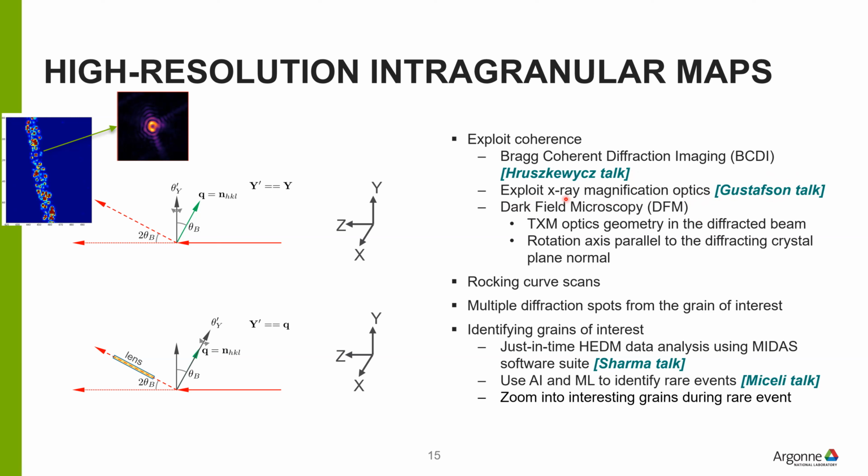This is so-called dark field microscopy, and basically this is using the X-ray optics, but in the diffracted beam geometry. Of course, we want to do this routinely and zoom in and zoom out. So we are really striving for just-in-time HEDM data analysis using the MIDAS software suite. Hemant is not here today, so I will probably give a little introduction to what we are thinking about in terms of the development pathway.